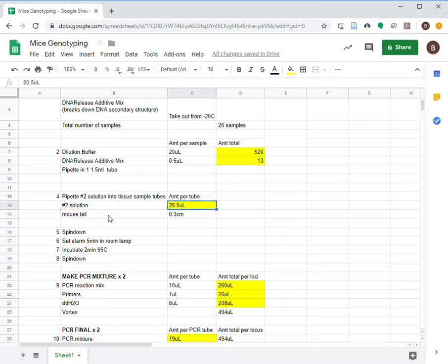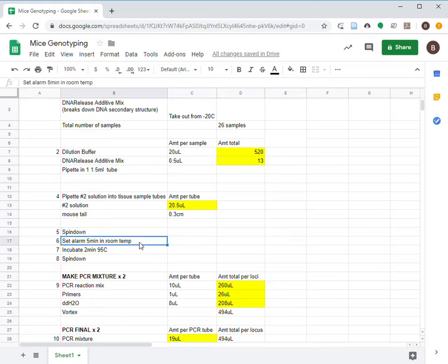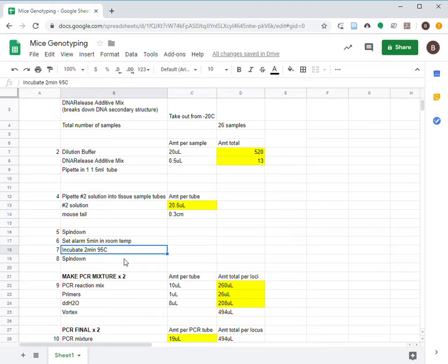Spin down the solution. Set an alarm for 5 minutes and let the solution sit in room temperature. Then, in 2 minutes, let the solution incubate in 95 degrees Celsius. Spin down the solution again.